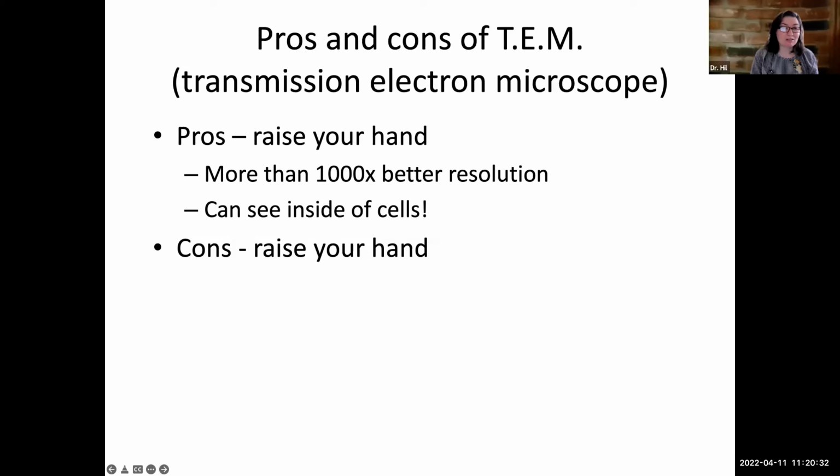So that requires a special tool. And it's not that the electron stream kills the sample. It's more that in order to see it with electrons, we have to kill the sample. And it's not even necessarily that the sample is dead per se. It's just that to prepare it to be visualized with electrons, we have to slice it very thin, as Andrew mentioned. So that's not going to be super awesome. Like so thin, like you're slicing a cell into many pieces.